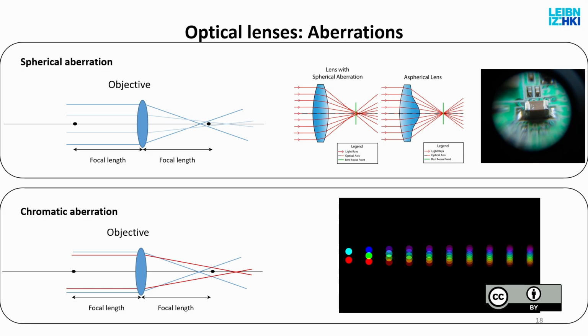Another unavoidable problem, and this you will actually see often in your practice if you are in microbiology or other microscope-related sciences, is chromatic aberration. It simply means that light beams with different wavelengths, different colors, will be focused at different focal points. Blue light, which has the shorter wavelength, will be focused closer. Red light will be focused farther.